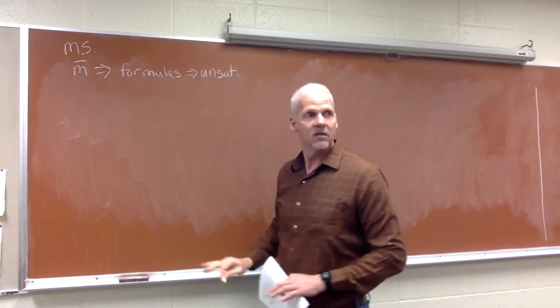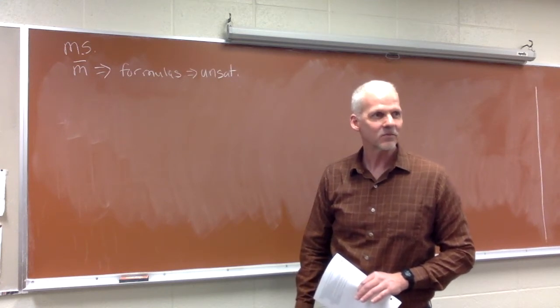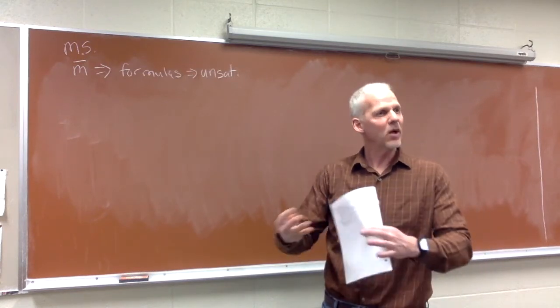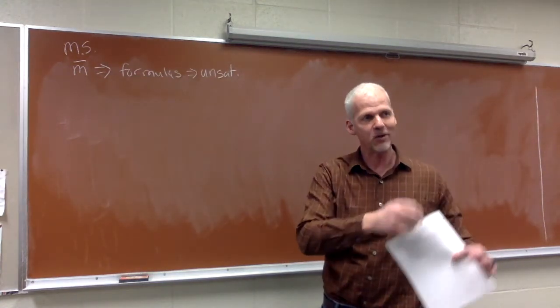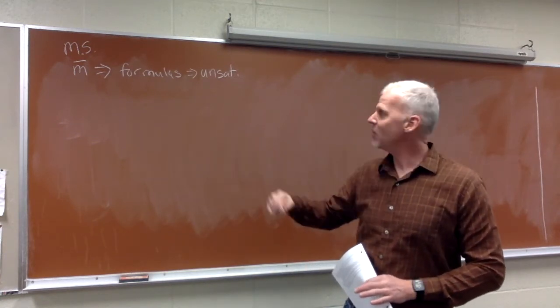How do we know if we have an oxygen or not potentially? What would help us figure that out? Yeah, well, this is how the different spectroscopic techniques would play against each other, where you might take a quick look at your infrared spectrum to see if there's evidence of an OH in that area around 3300 or the carbonyl at around 1700. We'll review IR in just a moment here as well.